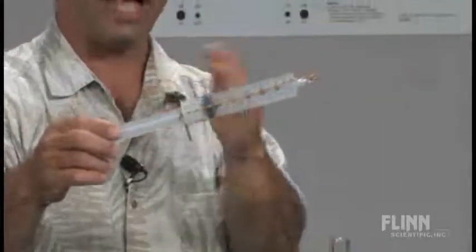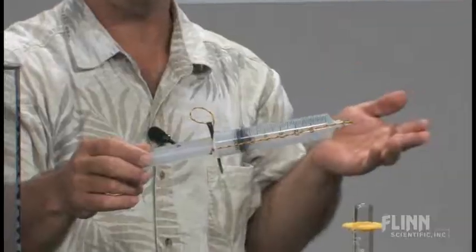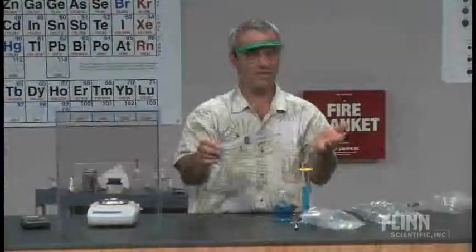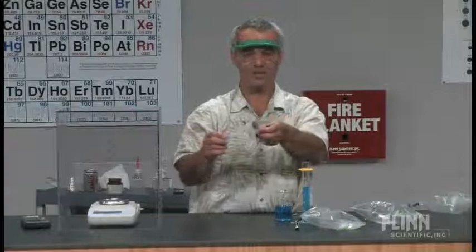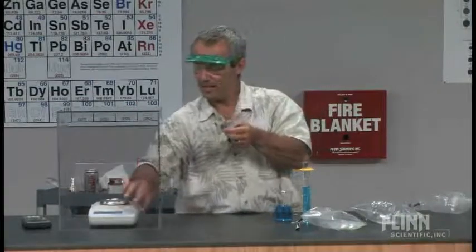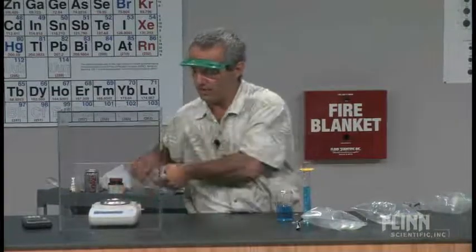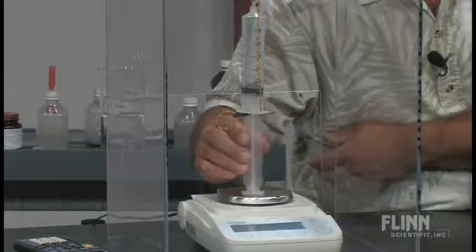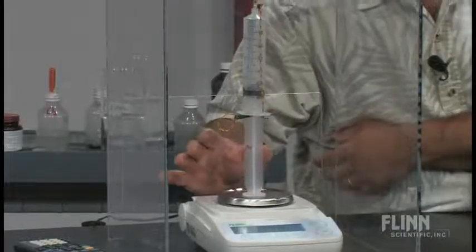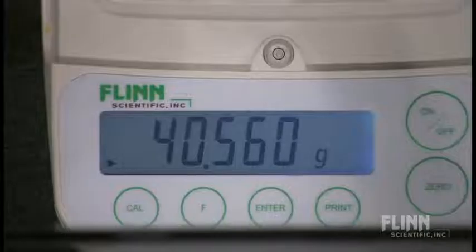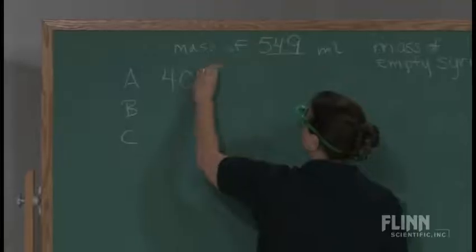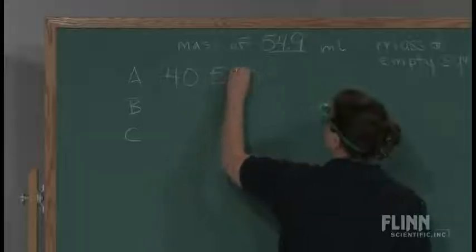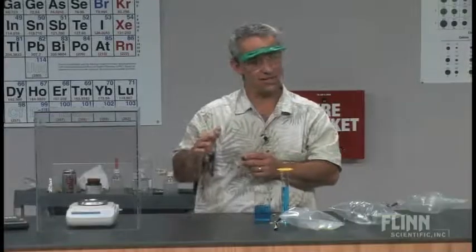Now doesn't that look exactly as it looked a minute ago with a vacuum in there? Will it weigh the same? Of course not. It's got a gas in there now, so we should see an increase in mass. Let me again re-zero it in case the scale has drifted. And we get now syringe and sample A: 40.560 grams.